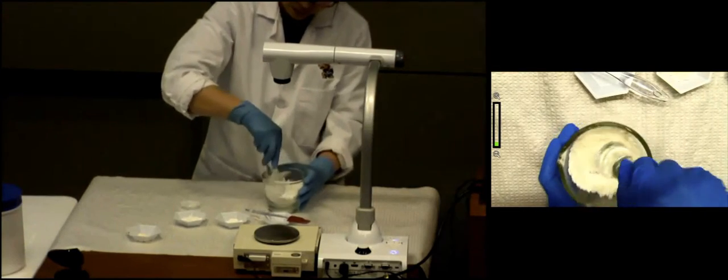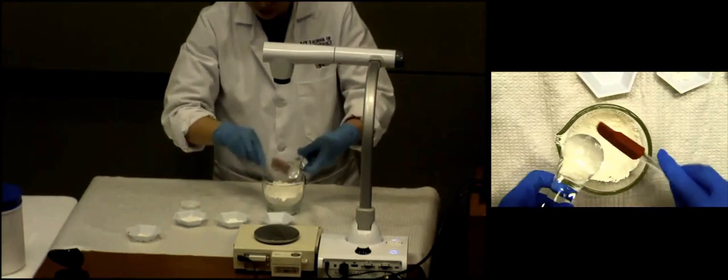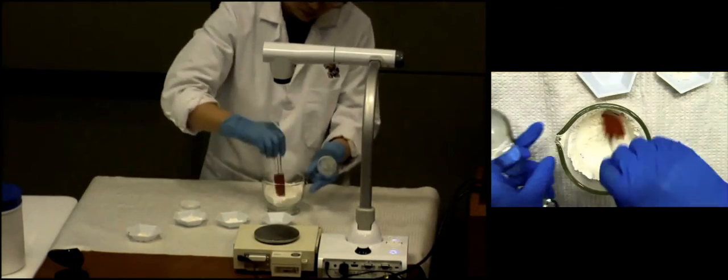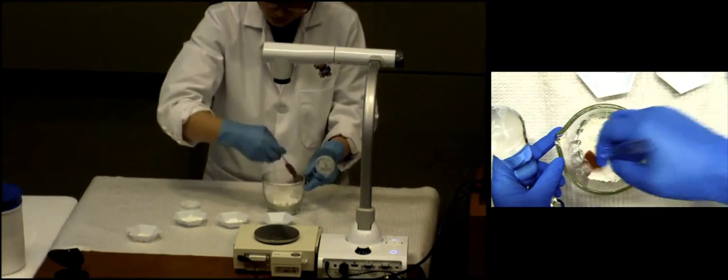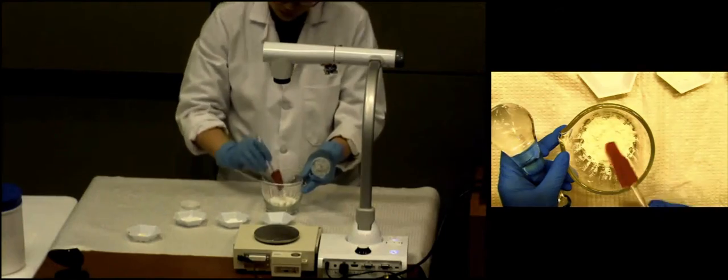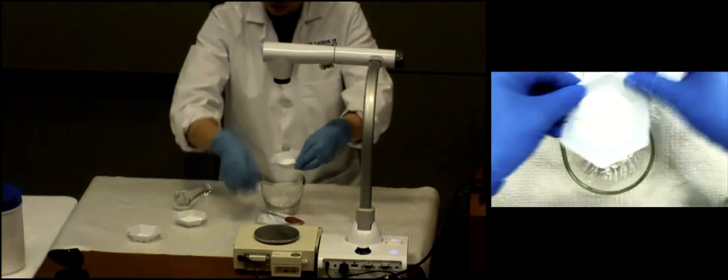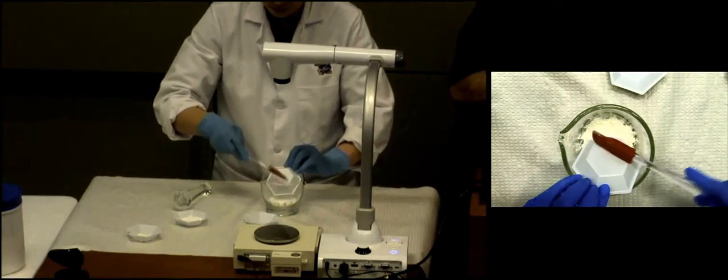So how will we know when they're evenly mixed? Were they both white to begin with, as far as the powder goes? So you're not going to be able to use color. The only way you can help ensure that is to geometrically combine. So you just start with even weights and do a good job of mixing and scraping down and mixing and do the best that you can. But that's why the geometric is important, because it's impossible to know for sure when they're completely mixed.